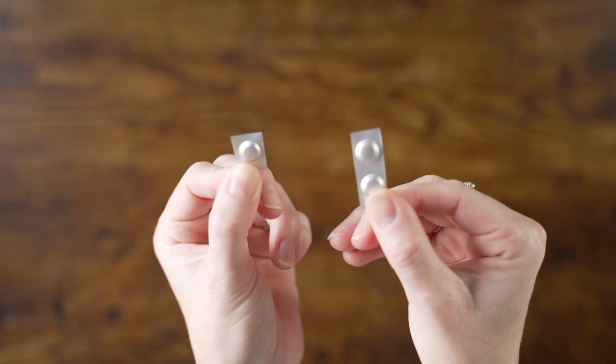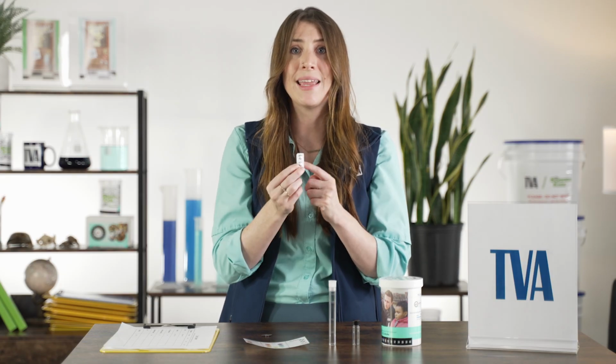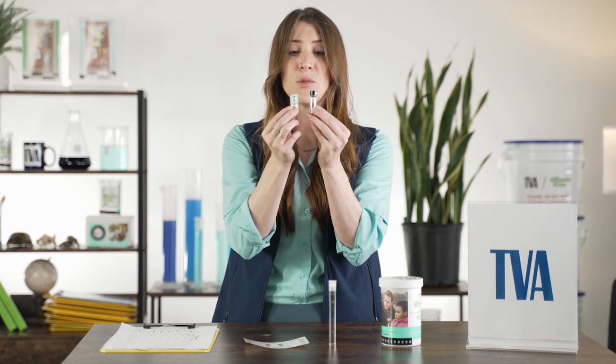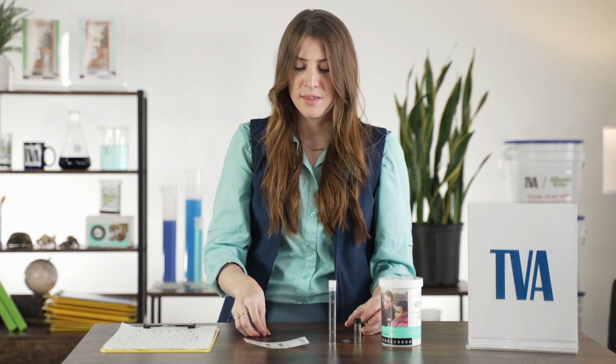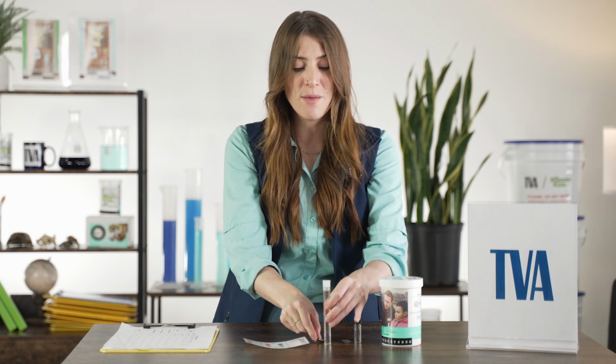There is a double bubble foil packet and a single bubble. This double bubble foil packet is for our dissolved oxygen test. Both of these chemical tablets will go into the vial. Also, the single bubble packet is for our pH test, and this tablet will go into the test tube. Now that we've checked our equipment and we have everything, we can start our first test.